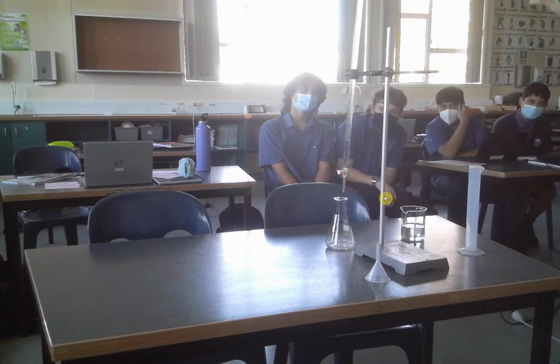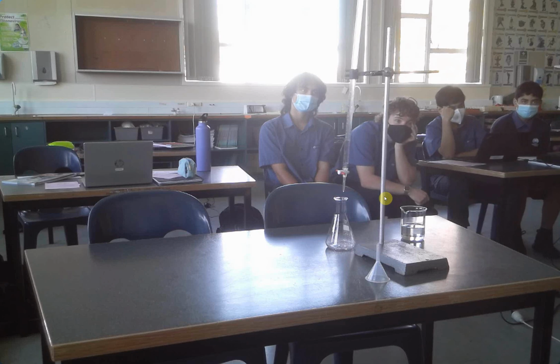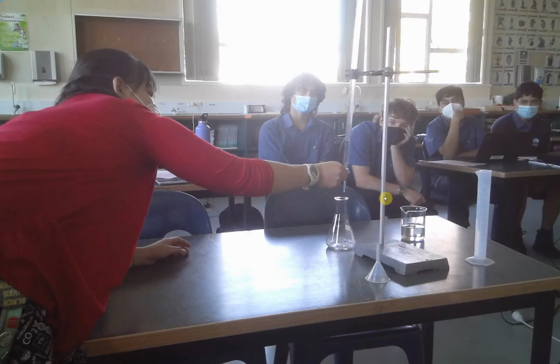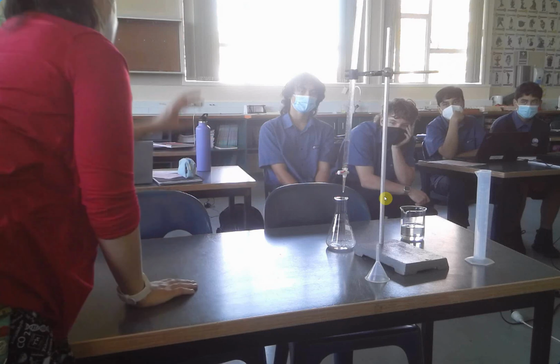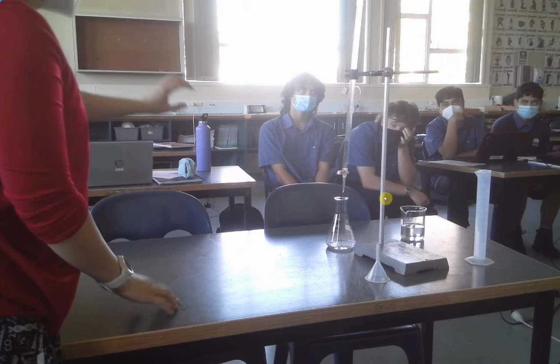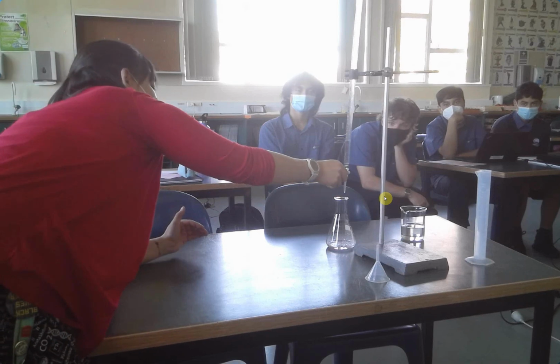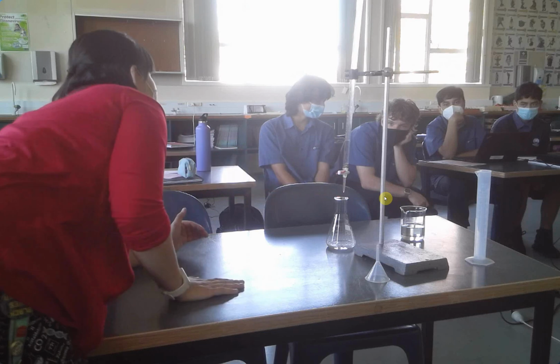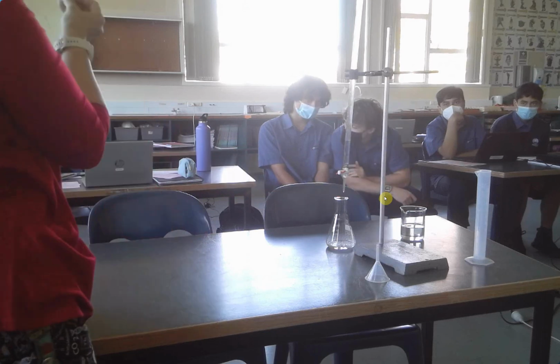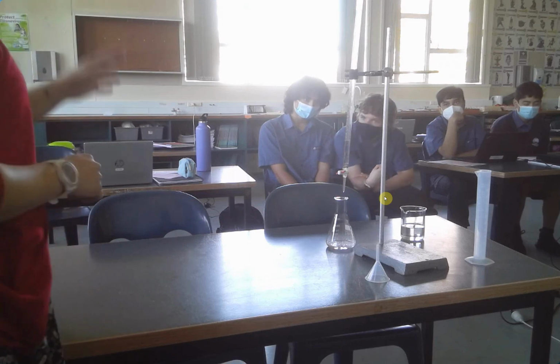What you guys notice here is that I filled it from the top like I would a measuring cylinder, but instead of pouring out from the measuring cylinder, we open these little valves here, and that's going to release the water, or in this case, chemical. You can control that valve and how much you're releasing, and that's really important, because if you want to get it really accurate, you might want to do the little drippy drop method, so it goes really slowly. That's what you're doing when you're trying to neutralize an acid and base: just one more drop, just one more drop. That's mimicking what you're doing with this burette. So that's the first thing to think about.